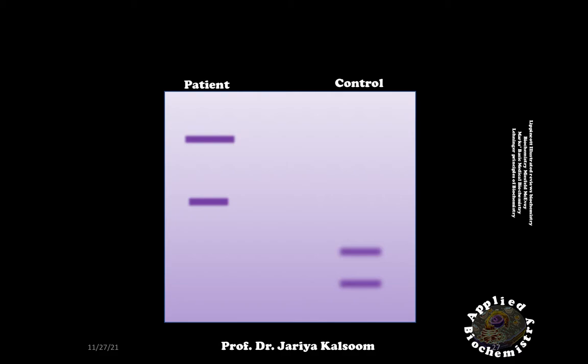Since this man is suspected to have Fragile X syndrome, for confirmation of diagnosis, the loci likely to be involved are amplified by PCR and further analyzed for mutations. Since mutation for Fragile X syndrome may cause a length difference in the PCR product, the length differences can be detected by gel electrophoresis of the PCR product.